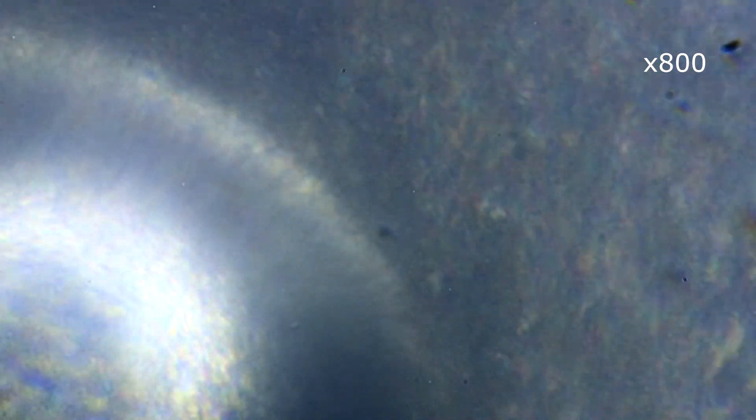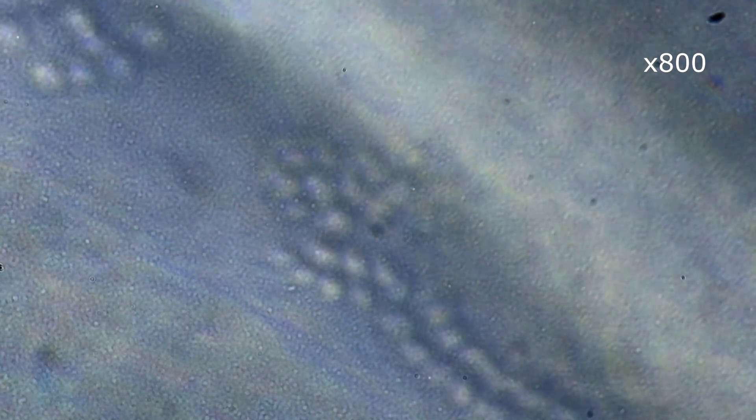And with a larger magnification the activity is so great that it becomes difficult to keep track of the work of yeast cells. Thank you.